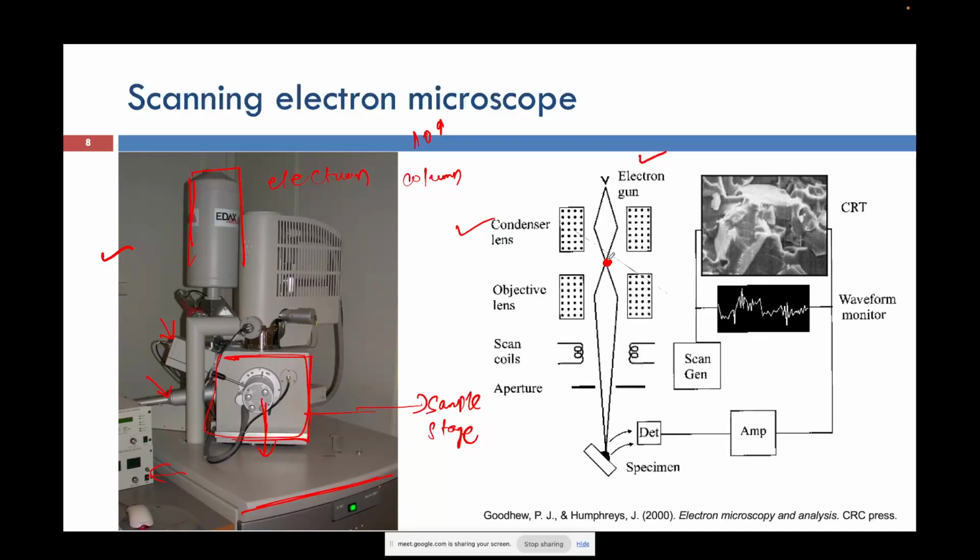And then all the electrons will again be coming out, because you cannot control the motion of the electrons if you leave them freely. So again, the objective lens will try to focus them onto the specimen here, and in between there will be scan coils, and a different set of lens systems are also attached nowadays, so that we have to face fewer aberrations.